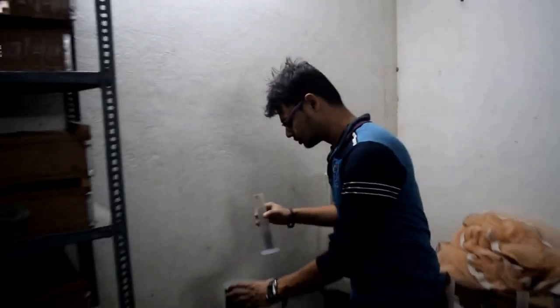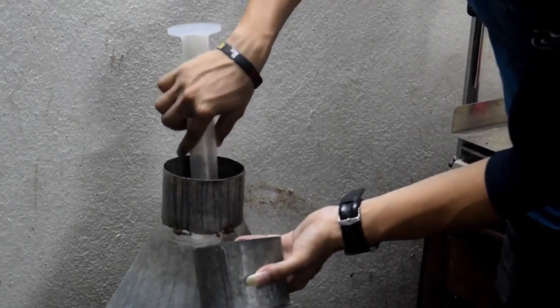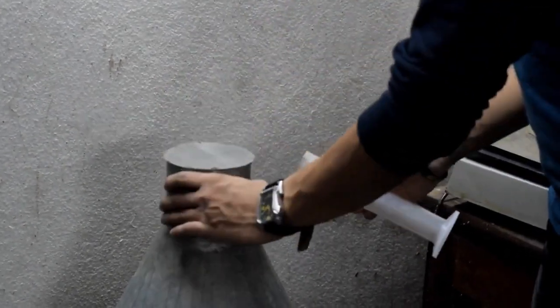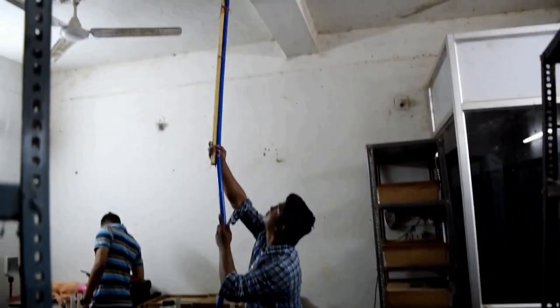The moths are released in the oviposition cages. Some moths escape and settle on the walls and ceiling of the rearing room. These moths are collected by mechanical device fitted with vacuum cleaner directly into the oviposition cage.